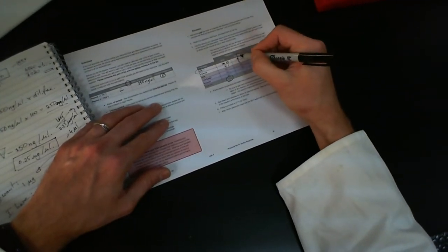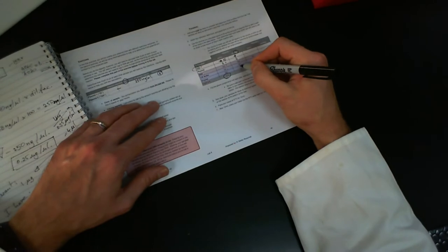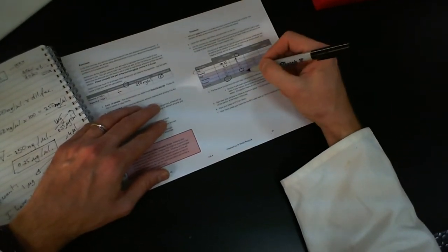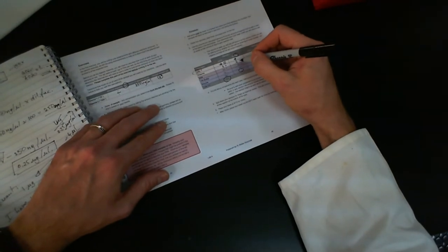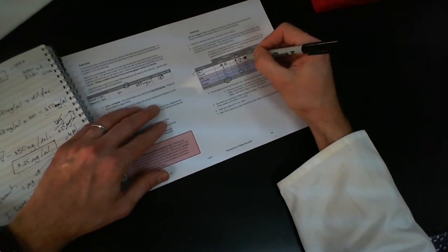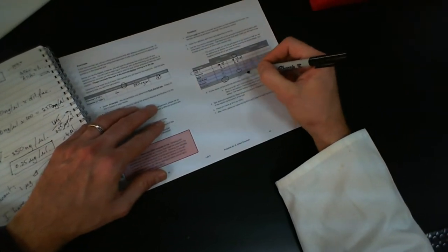Now for this one, this is our negative control, it does not have an enzyme. It's going to be our uncut. So here we have 4 microliters plus 4 microliters of your plasmid, which means you have a total of 8. That means we have 12 microliters of water we need to add to make a total volume of 20 microliters.